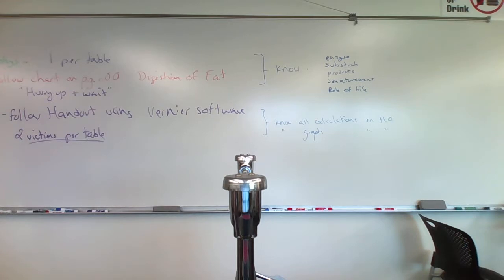So tube 1 is just lipase and water. What's in tube 2? Litmus cream and water. Litmus cream is right here. Remember biology 112, litmus paper changes color with acidity. This is simply ground-up litmus paper, so it's a purply color. You're going to add the same thing, 5 and 5.